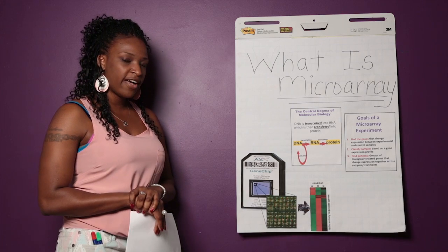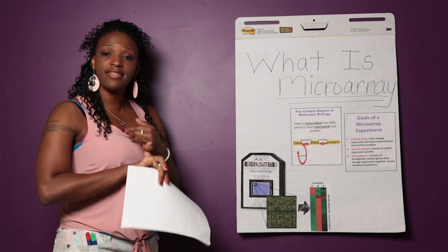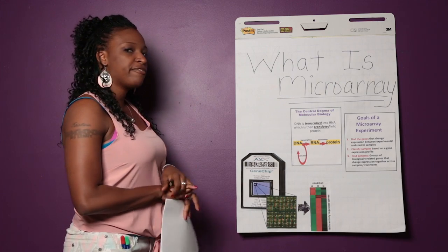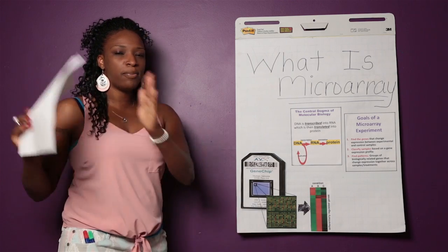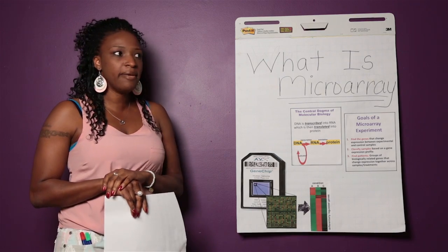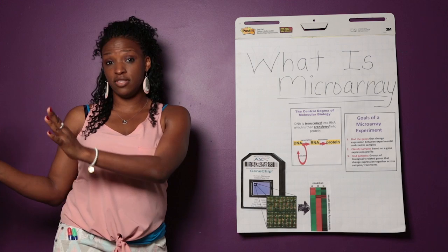The expression profile would show green or red based on whether the gene is upregulated or downregulated. And then from that, we can actually see where patterns occur, or which set of genes are all upregulated together, and we can actually group these genes and say that maybe these genes have the same biological function or contribute to the same biological function.